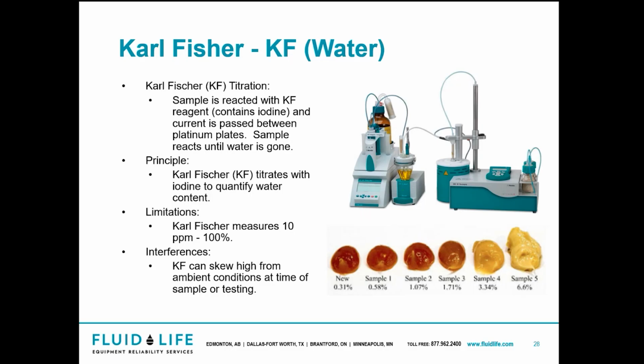Now, these grease samples are showing the different physical appearance of highly water contaminated grease. So notice up to about 1.71% water contamination, it looks essentially the same, right? So that's why we need to do these tests, right?